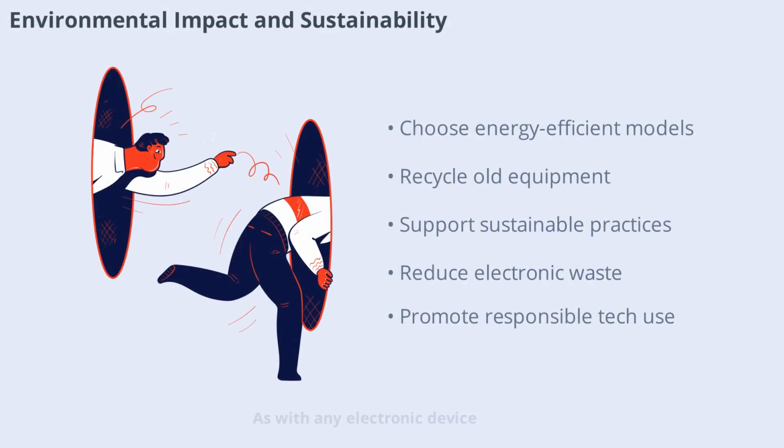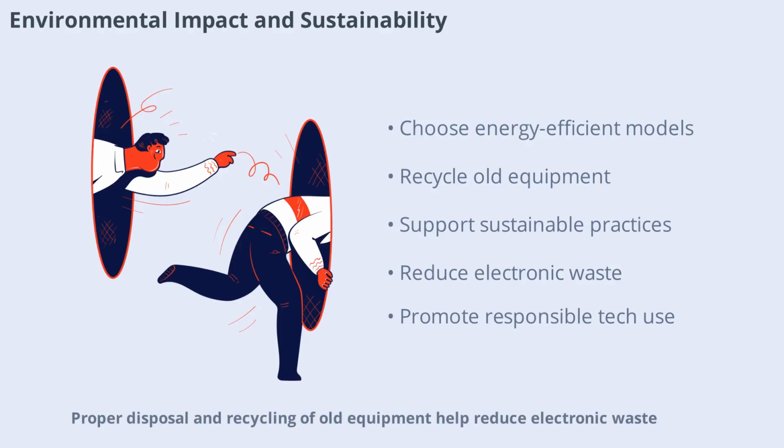As with any electronic device, consider the environmental impact of your digital microscope. Choose models with energy-efficient LED lighting and recyclable materials when possible. Proper disposal and recycling of old equipment help reduce electronic waste. Supporting manufacturers with sustainable practices contributes to a healthier planet and responsible technology use.